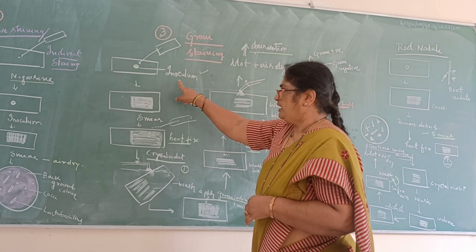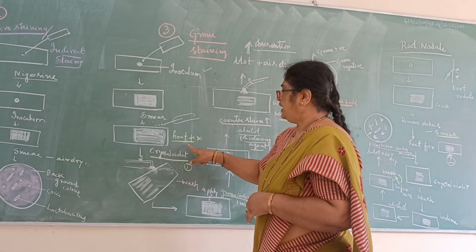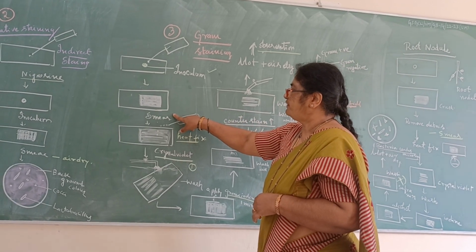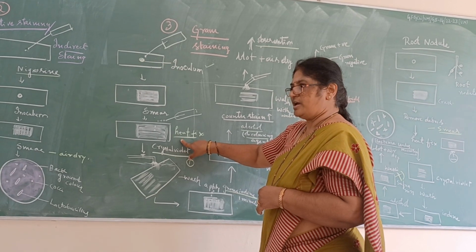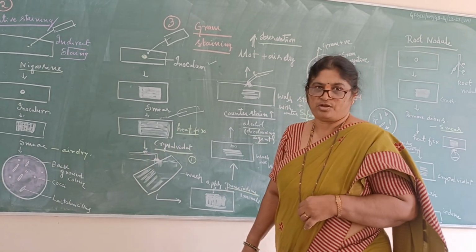Here the inoculum is taken on the slide, then the smear is done. After smearing, we do air drying, then heat fixing is done. Heat fixing is done because of the washing steps; the inoculum should not be washed off.